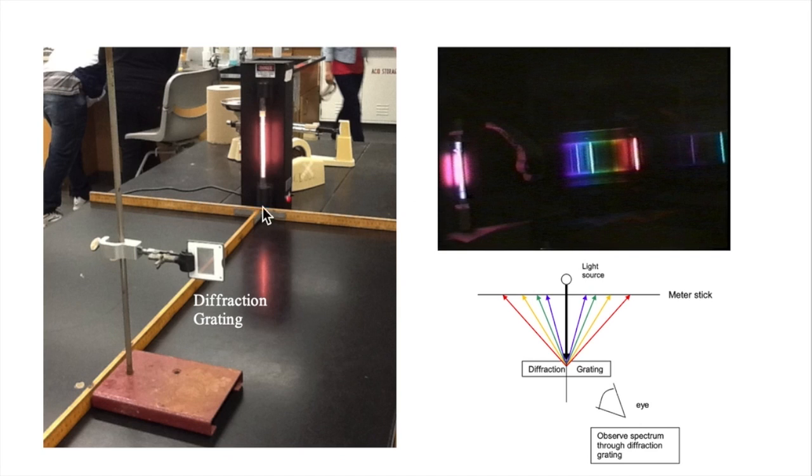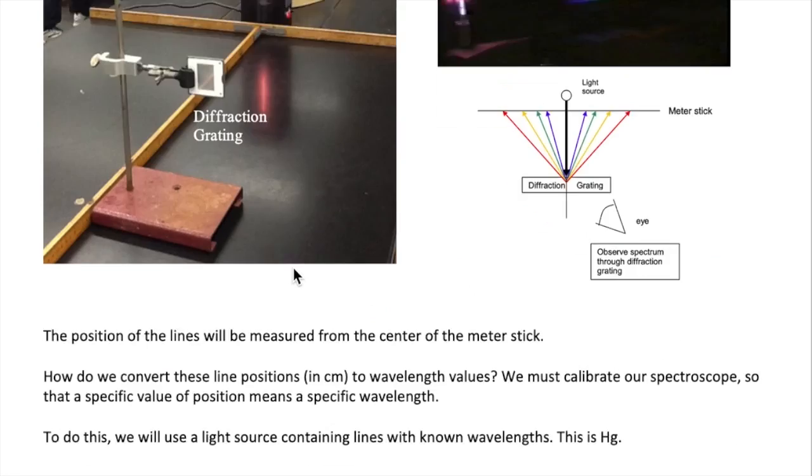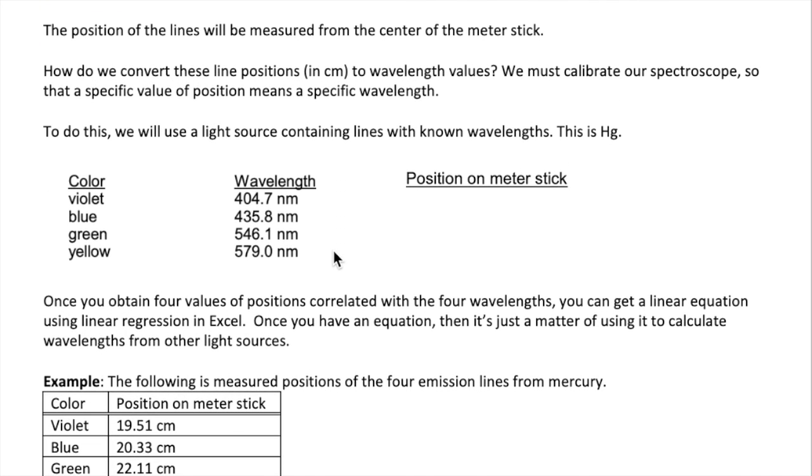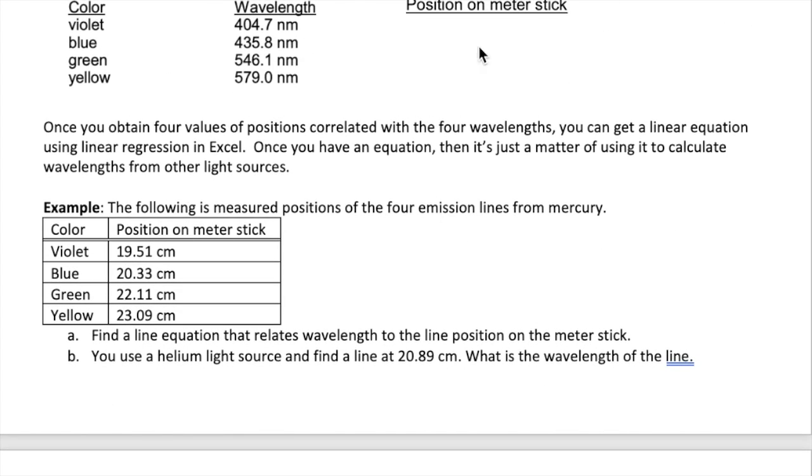The lines will be positioned along the meter stick, so you can measure their distance from the center of the meter stick. You can then convert these distances to actual wavelengths. To do that, you're going to need a conversion equation. This can be obtained by calibrating the spectroscope, which just means to measure the distances of the lines with known wavelengths. We will do this using a mercury gas discharge tube. Mercury has four lines corresponding to the four wavelengths shown here. What you will do is measure the position of each of these lines on the meter stick. Once you have all the values, you can then do a linear regression in Excel to obtain your line equation.